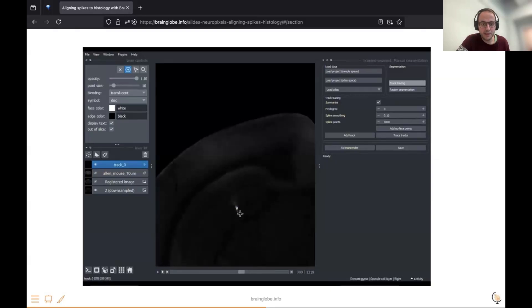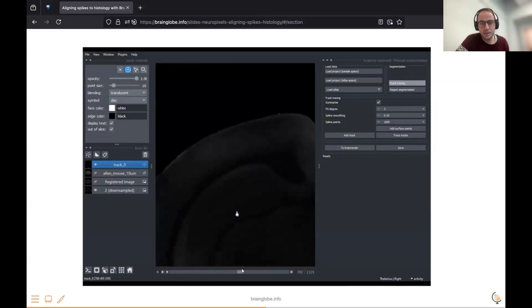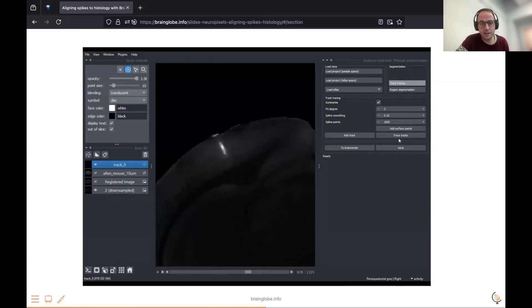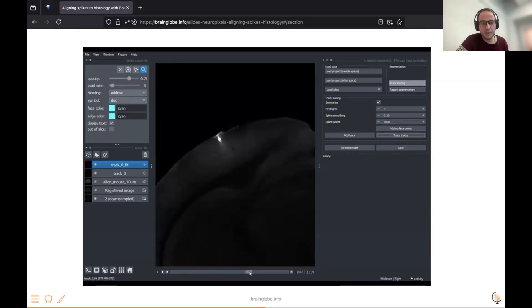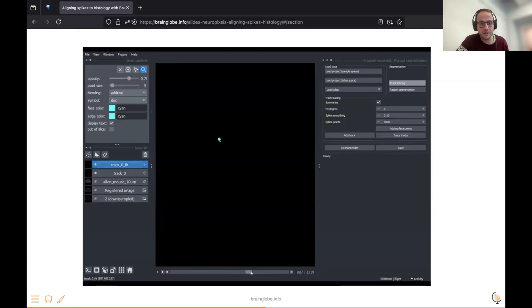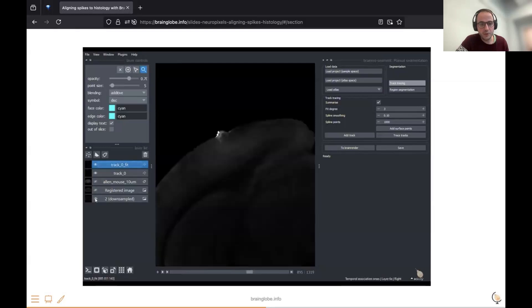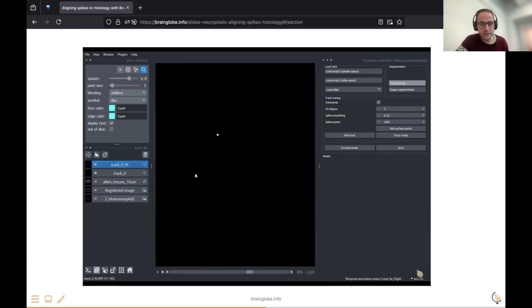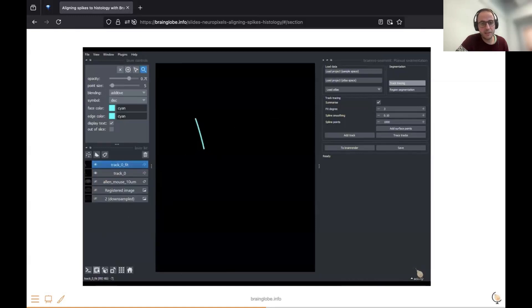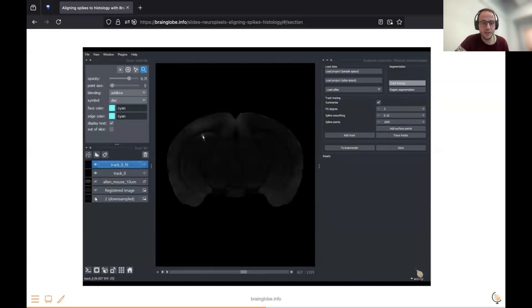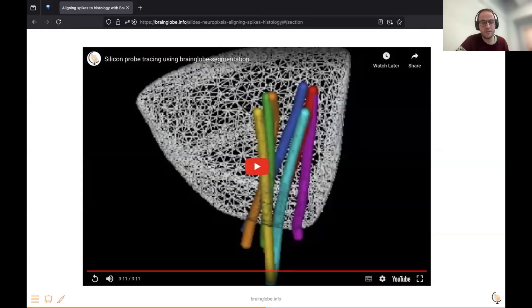Sometimes it's a bit tricky to find the tip of the probe, so you want to make sure to include that. There's also the spline points parameter on the right — you can set how many points you want in the curve fitted to your data points. In this case it's a thousand. You can then see the probe in three dimensions, where a line has been fitted to the probe, and you can save it for visualization.